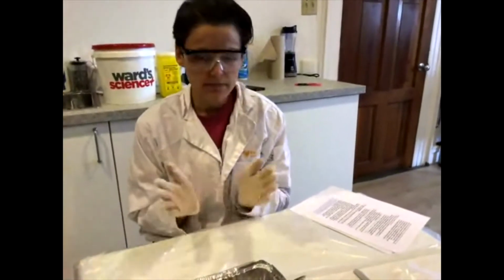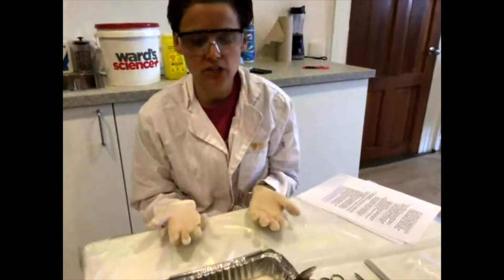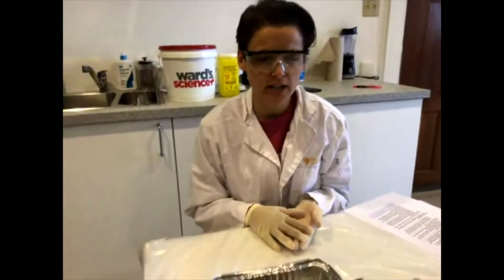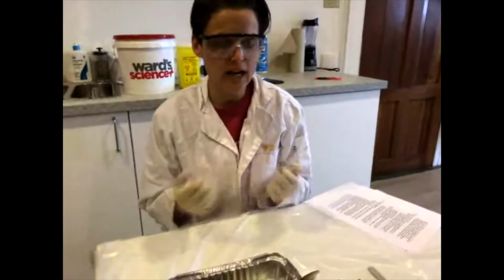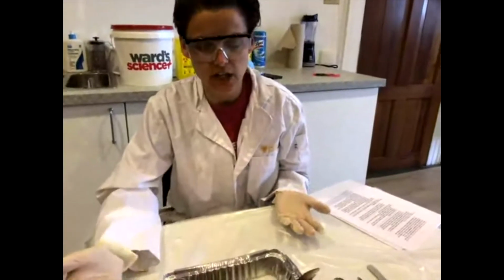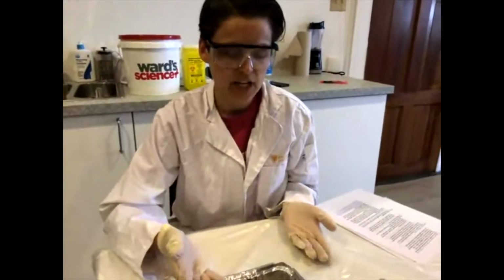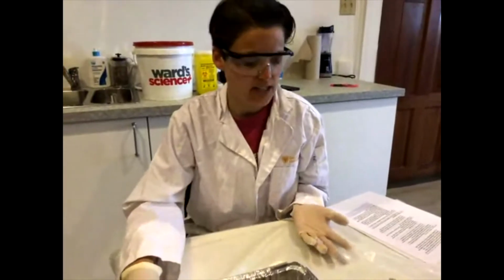Okay, so this is the time to start with your perch outline. One of the reasons why we're going to draw along with this dissection is because biologists in particular use drawings to record things that they learn. One thing that we do a lot of is lab drawings, or recreations of what we see, so that we have a record of the different organs that we're going to see inside this animal. Because of course, once we do the dissection, we can't keep this. It won't preserve forever. So a lab drawing with labels is a good way to keep track of what we've learned.